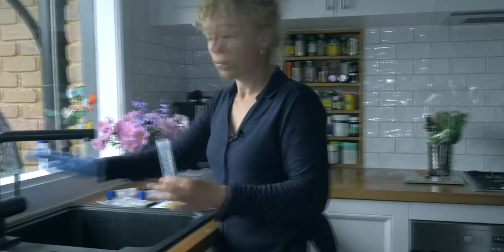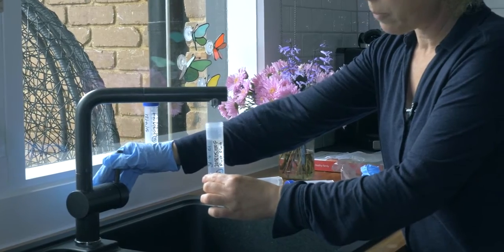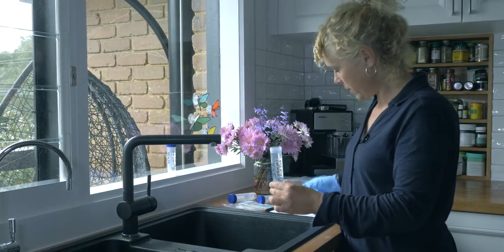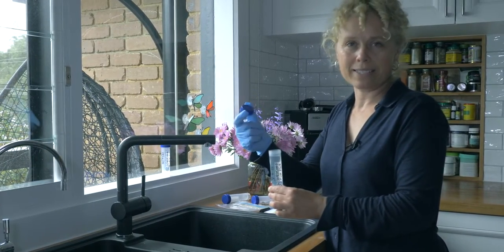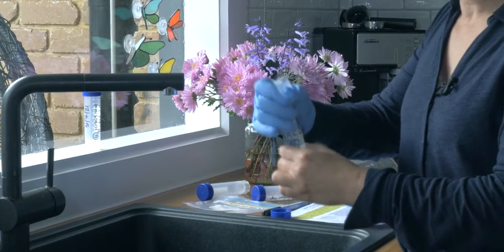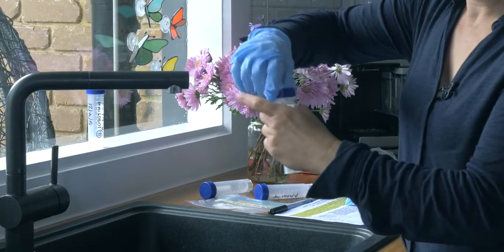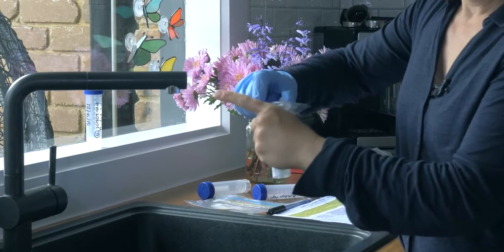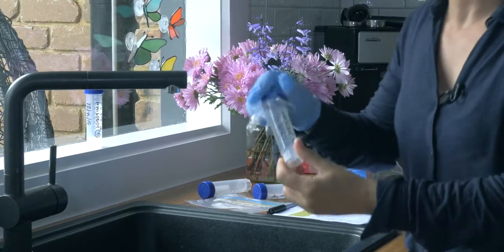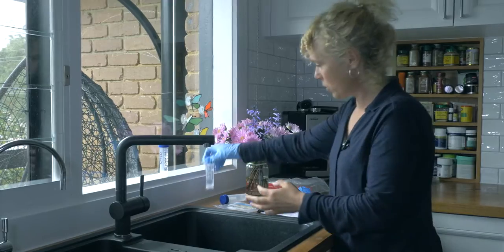I'm then going to, on the cold water, just open that up like that, and I'm going to fill it up right to the top. I want about 50 mils, like that. Now, when you're doing water samples, it's really important because sometimes lead is used in plastic. So you want to make sure that the lid doesn't contaminate the sample by putting this plastic that's lead-free over the top and then putting the lid on top like that. Making sure, just tip it to the side so no water comes out, because of course in the mail, if the water comes out, that's going to be useless. So that's how I would take a water sample.